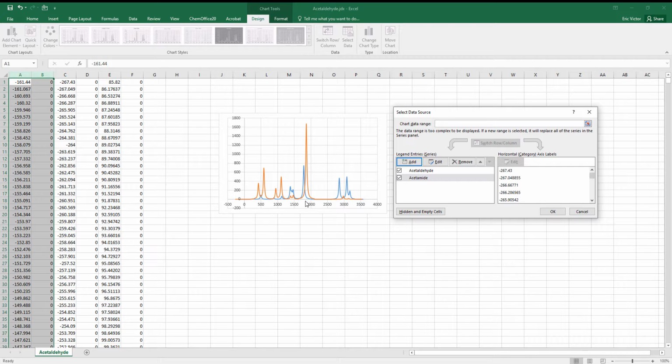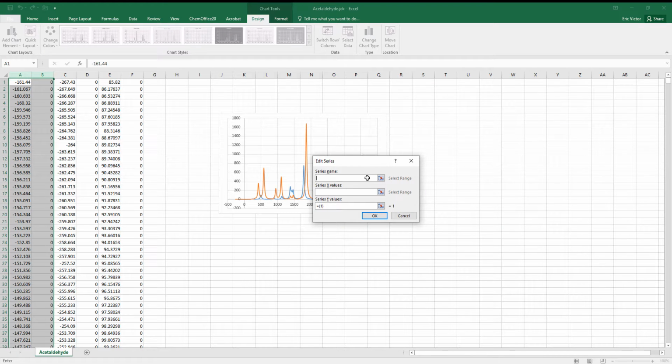And so now the acetamide data is orange, my acetaldehyde data is blue. They're directly overlapping with each other in these cases. So I can see very clearly some things that are very similar. I can see some of these points are very close. I can see the differences here in those carbonyl stretches very dramatically, and very easily by eye now without having to look at the numbers. So we have those two now. The last thing we want to do is add the acetyl chloride. So again, just click on add. I'm going to put in the name, so acetyl chloride.